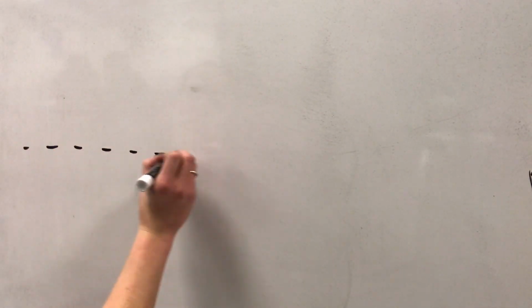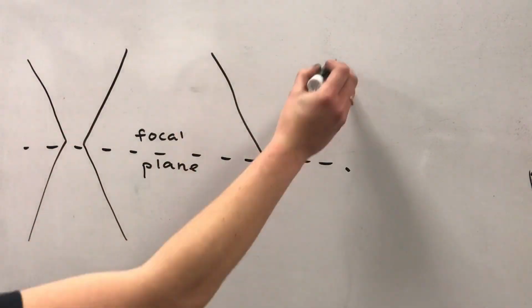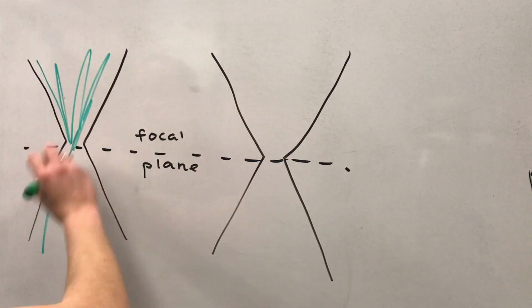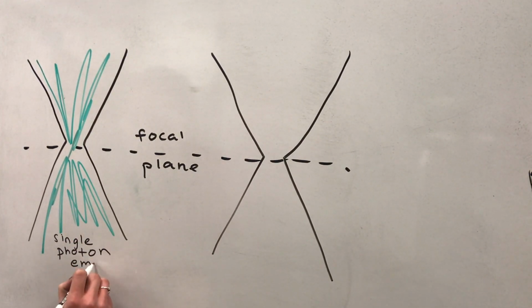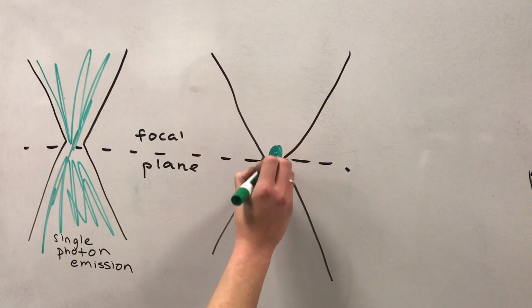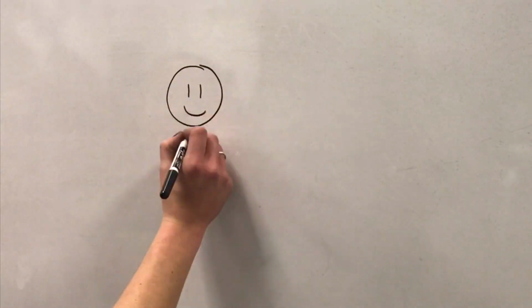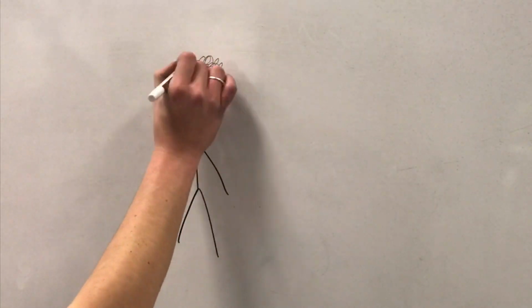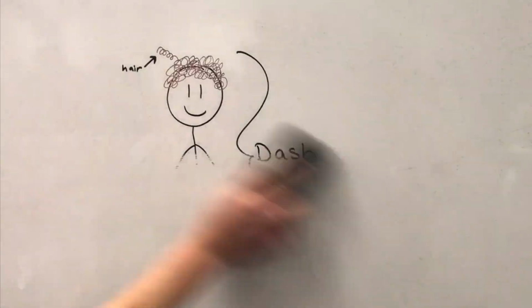Even though the laser is scanned over the entire specimen, fluorescent excitation only occurs when the two photons interact with a molecule at the same time. This means TPM has a much smaller focal volume than the focal volume seen in confocal microscopy. It is important for the photochemical interaction volume to be small when imaging biological specimens in order to minimize damage to the specimens. Focal volumes can be as small as 0.1 micrometers in TPM. That's nearly 1,000 times smaller than the thickness of a human hair.